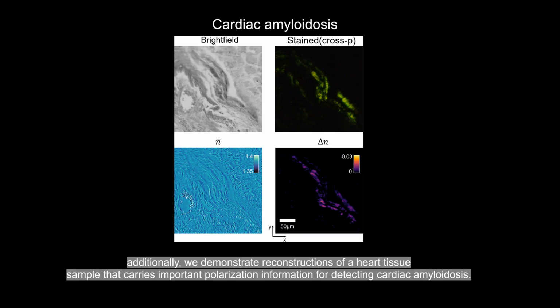Additionally, we demonstrate reconstructions of a heart tissue sample that carries important polarization information for detecting cardiac amyloidosis.